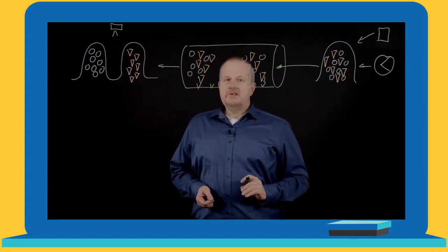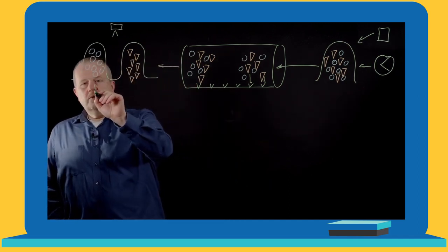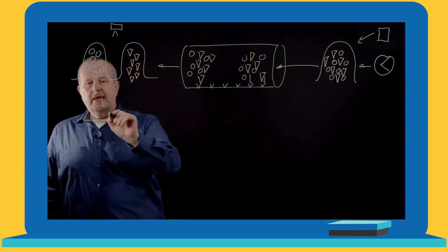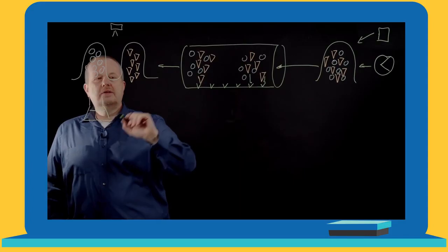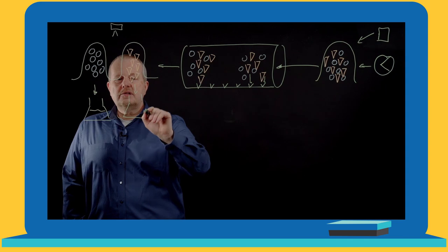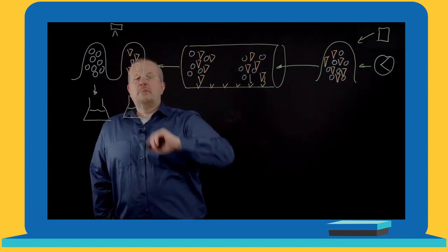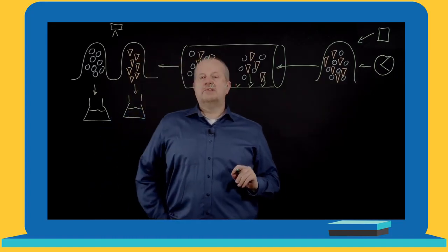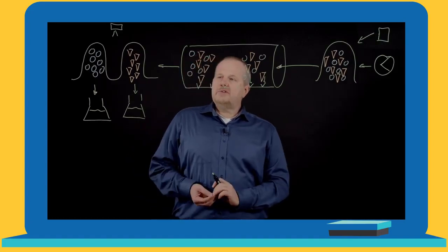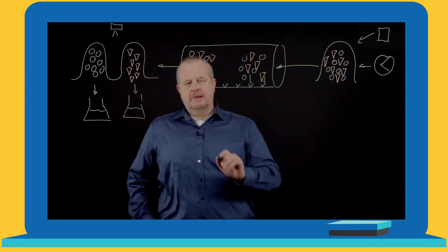So with that, we have nearly a complete chromatographic system. The only thing still missing, because we are working in preparative chromatography, is that our goal is to separate these quantitatively, and we would like to have them collected in the end. So in contrast to analytical chromatography, we are really interested in what is coming out here to be separated, isolated, and further processed. What we see at the end of our chromatographic system is a chromatogram.